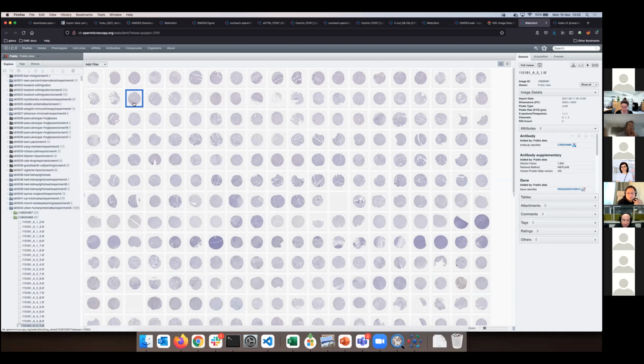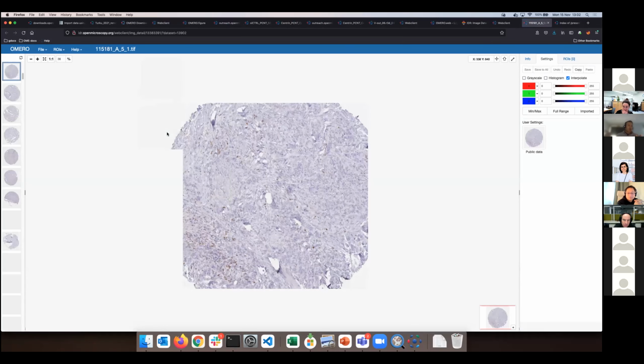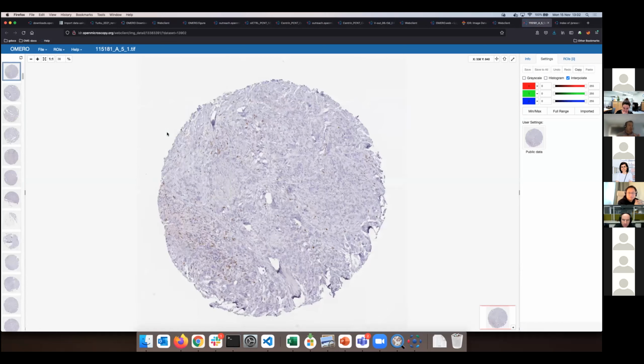So we create a soft link to where the data are on disk. And then you can do anything that has been shown by Peter. We just say, okay, we know where the data are, and when we need to fetch them, we fetch them. That could be done in parallel as well. So the data only move at the time of acquisition, and after that the large volumes don't move.